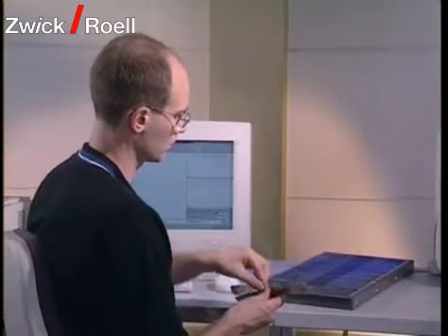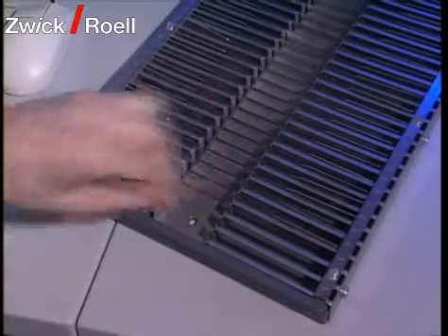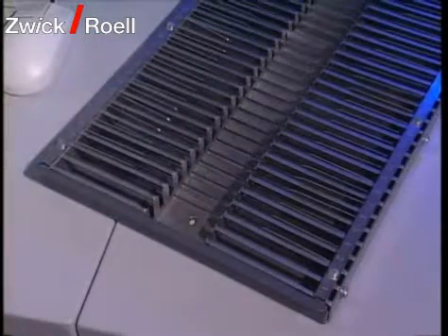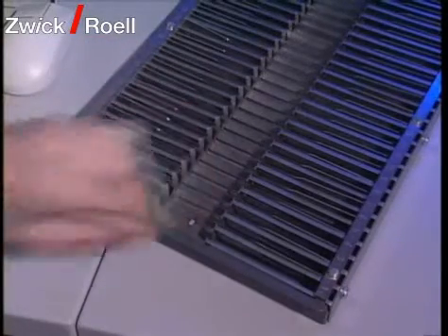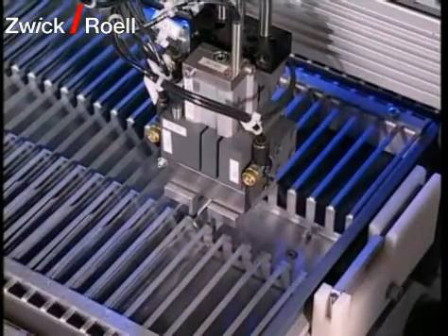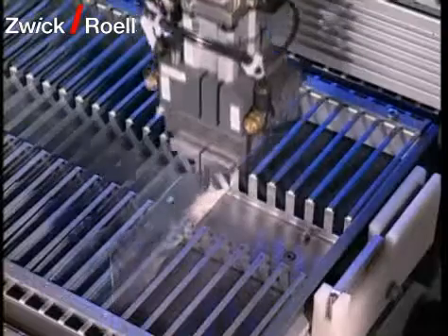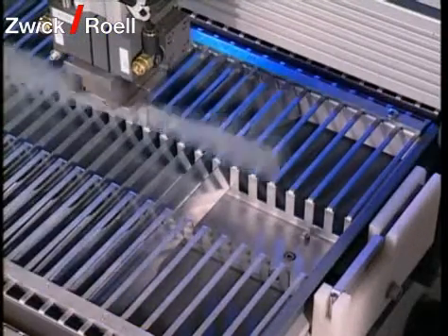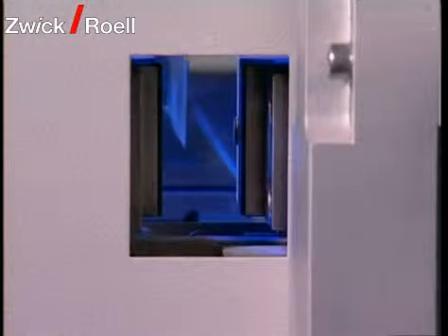The test sequence for metals is similar, except that the metal specimens are placed individually in the magazine. A pincer gripper is used to move the specimen to the cross-section monitor.